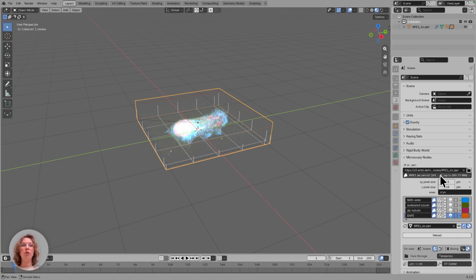However, the reload will also by default apply all the settings that have been changed in here. So we can, for example, if we change the colors, this will affect how things are being shown. If we want to turn that off, we can turn off the update settings button, and if we want to turn off updating the data, we can also only update the settings.